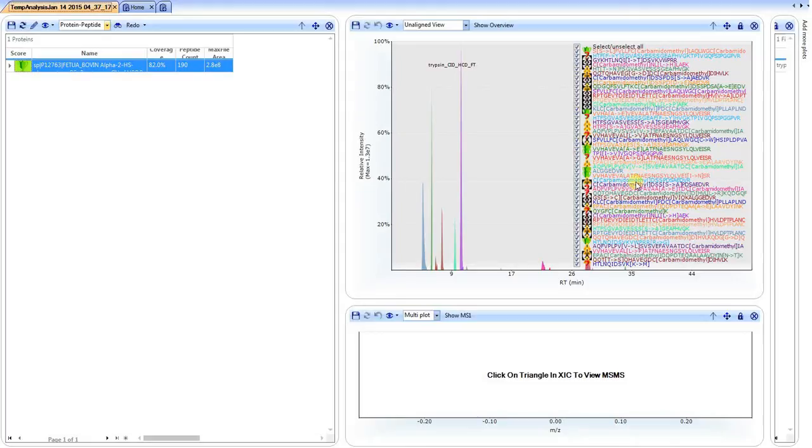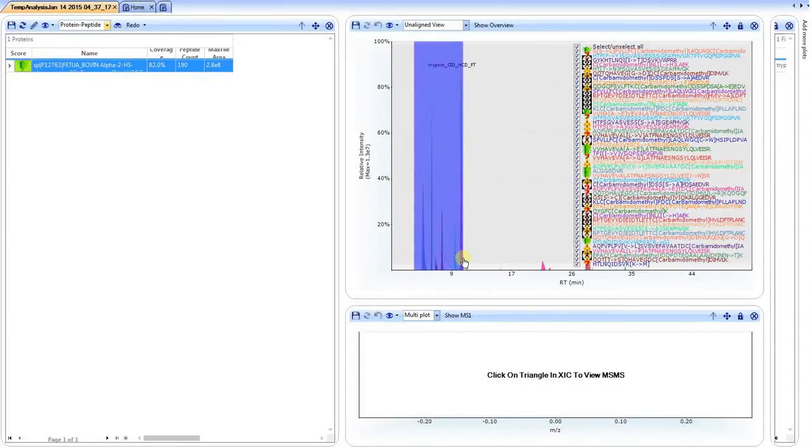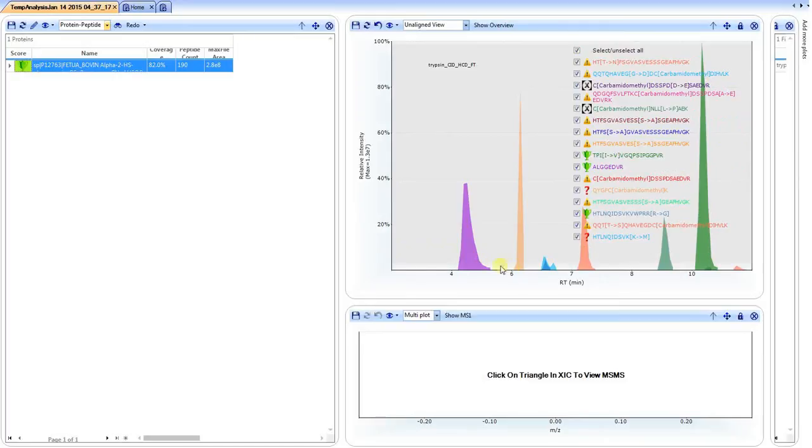In this case, there's about 190 peptides or variants that it's found, and you can see all of them are crammed in here. But of course we can zoom into specific regions, and the key only shows those particular peptides that are eluting in this particular time window.